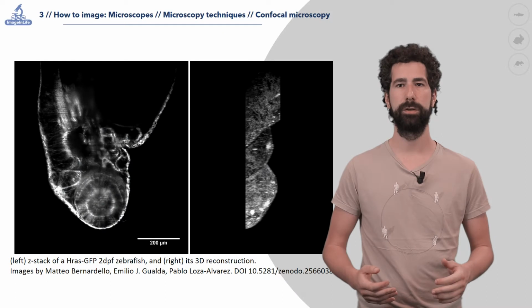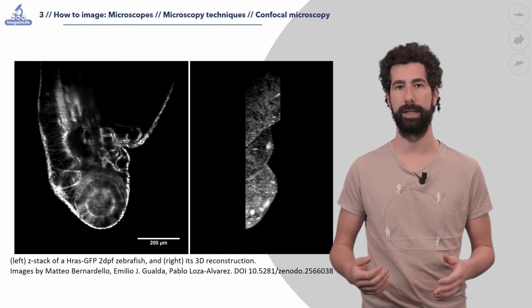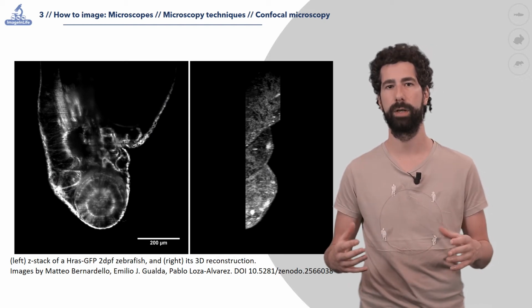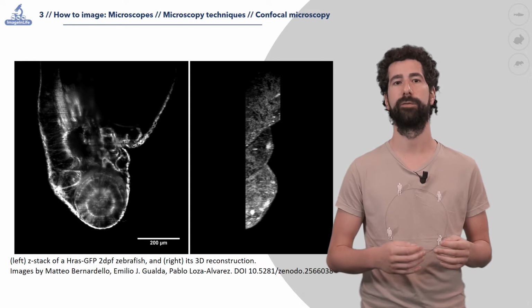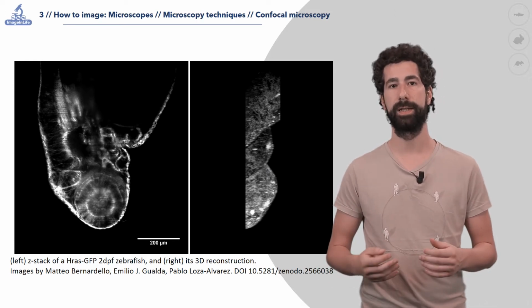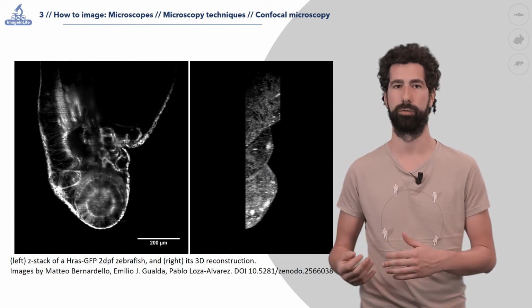In the previous lecture, we have described the mechanism of wide-field fluorescence microscopy, which is a very fast technique as we record the image of the entire volume of the sample in one exposure time of the camera. However, it cannot give a complete description of the 3D structure of the specimen. Moreover, for thick samples, it could give rise to blurred images, and there is no discrimination between the plane of focus and the planes that are out of focus.